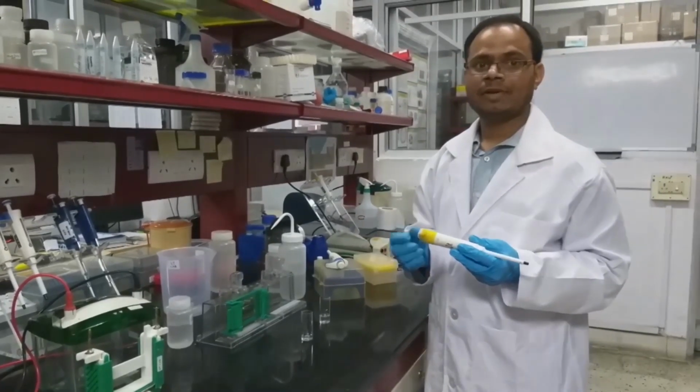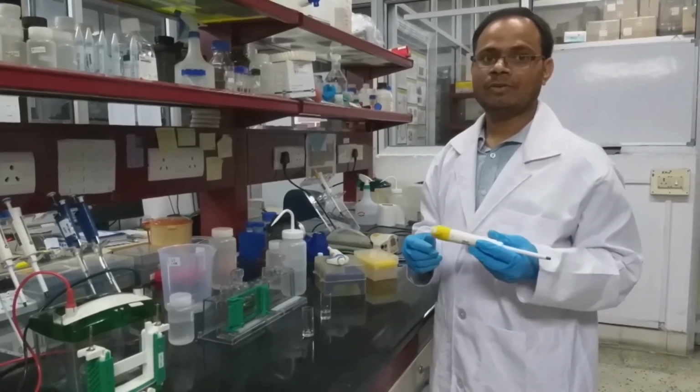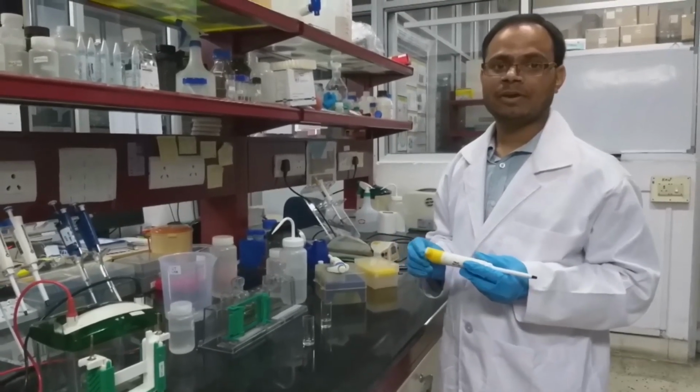50 microliter of APS and 50 microliter of SDS we have to add. At the end we have to add 5 microliter of TEMED.